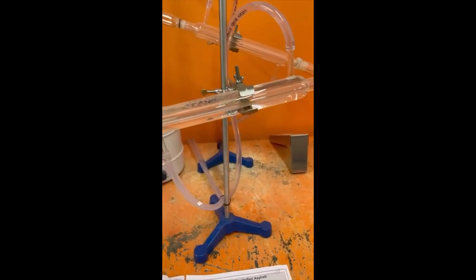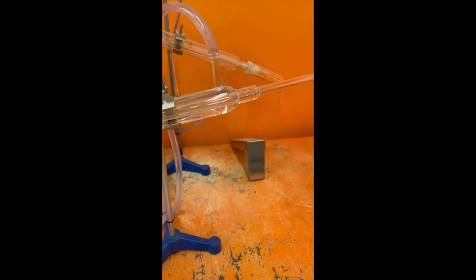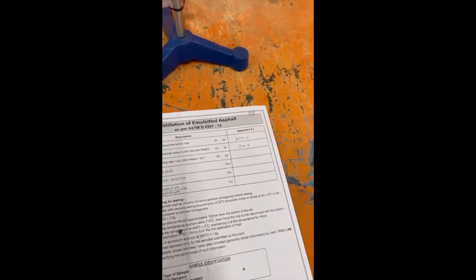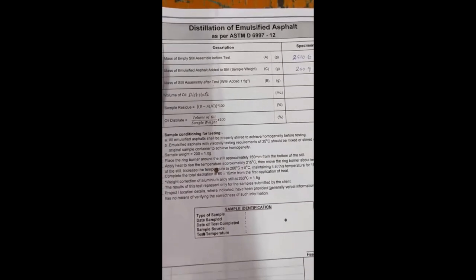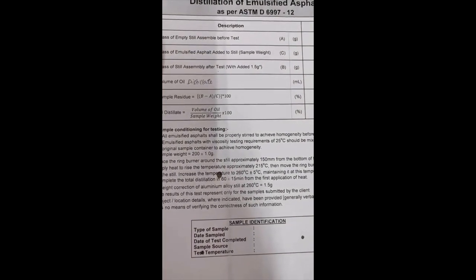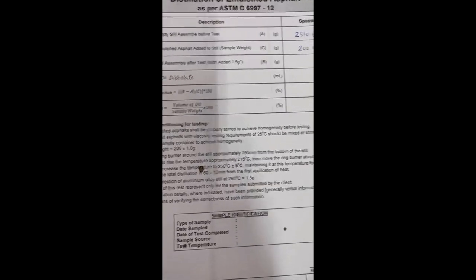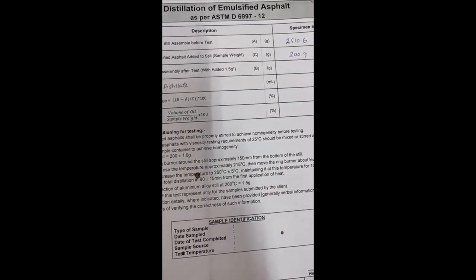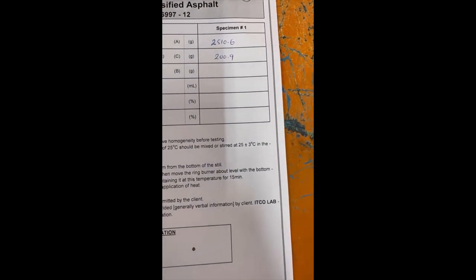Now the sample here, this is emulsified asphalt. We took the mass of the empty steel apparatus, 2510 grams, and we added asphalt, 200 grams.